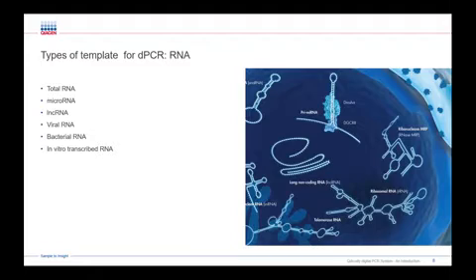Of course, also RNA, after conversion into cDNA, is an important starting material in dPCR. Gene expression analyses not only include the quantitative determination of messenger RNA molecules, frequently using total RNA, but also the quantification of microRNAs and long non-coding RNAs. dPCR recently has become an interesting alternative to qPCR in the vast field of RNA viruses, such as HIV, influenza, or most recently SARS-CoV-2.